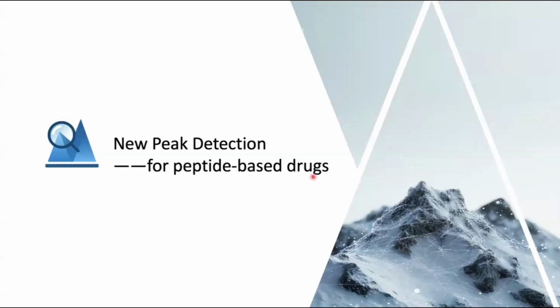So the new peak detection function is essential for biopharmaceutical development. It identifies new peaks, tracks the metabolite variation trends, and flags product-related impurities or changes over time.